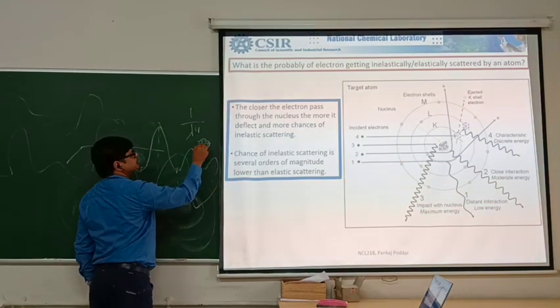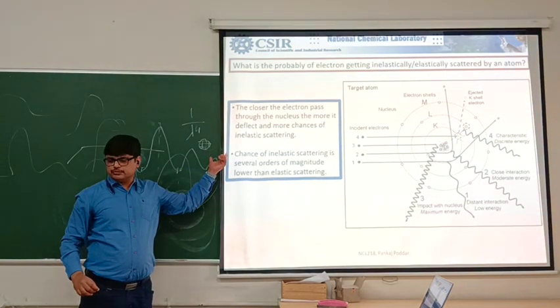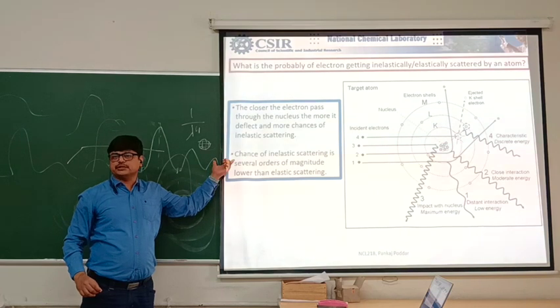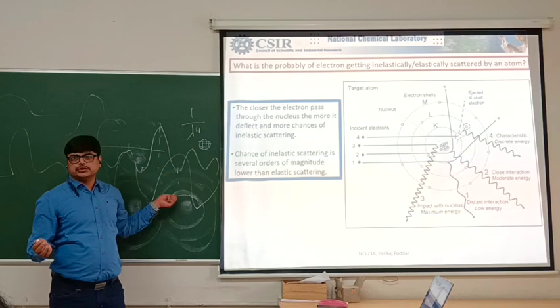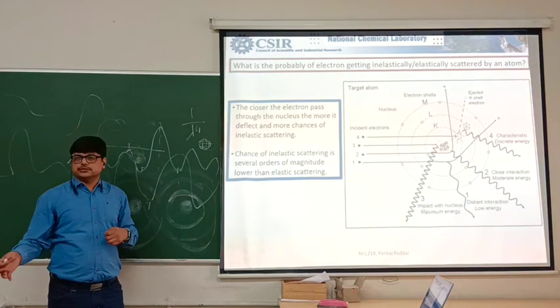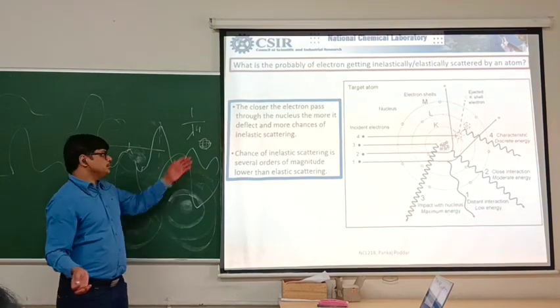It's a mesh of copper. So it's hollow, but it is copper. So it provides a conductive path to the sample holder. So it keeps on and then it goes to the earth actually. So that is basically earth. So any excess charge will be neutralized.